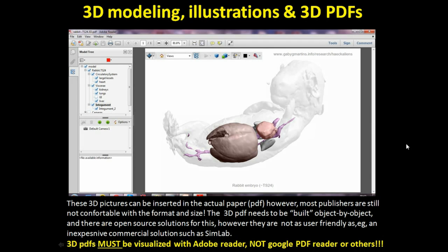So just to give you ideas of what you can do with these data sets, don't just have them in your lab, share them openly, because you may not just be saving other people a lot of hard work by trying to recreate things that you've done already, but it's actually a good manual for anatomy that students, even high school students interested in anatomy and embryology, can actually take advantage of. So that's one of the things I like about the open source aspect of it.